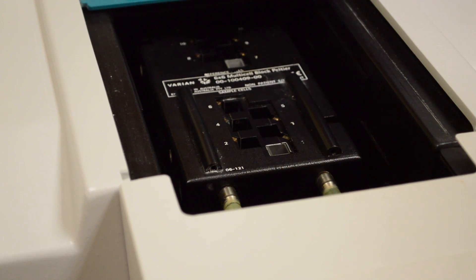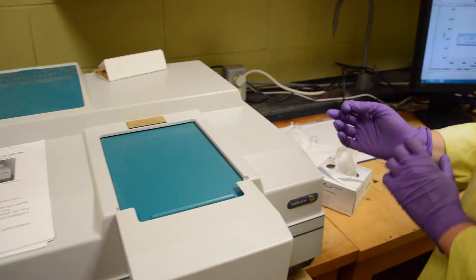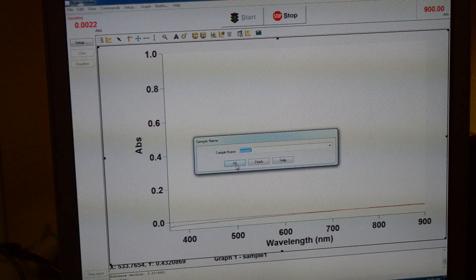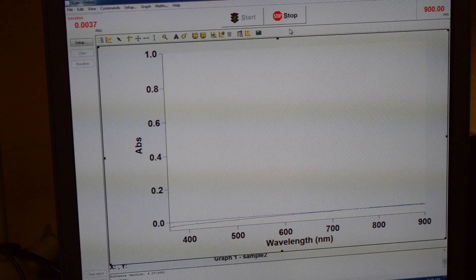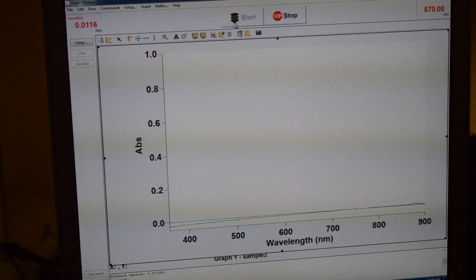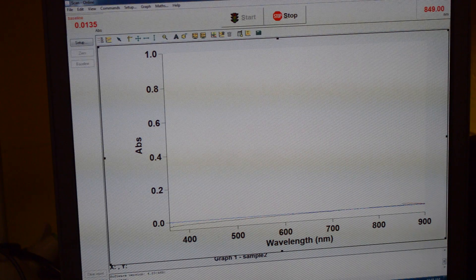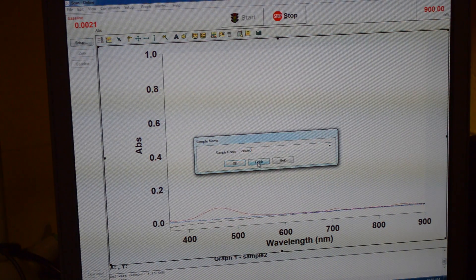From there, you're closing the lid and you will go back to the computer to press start. This is sample two, so we are going to press OK. Once the green light shows on the start button, we are going to press start to retrieve the next sample. When the sample is finished collecting, you're going to press the finish button.